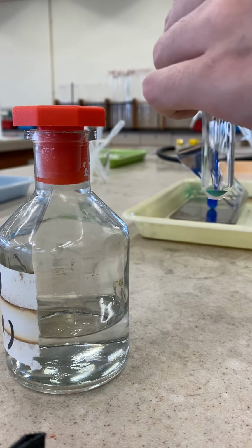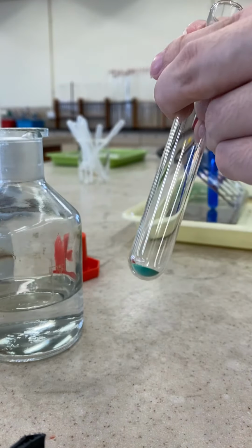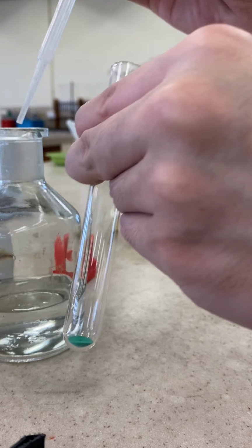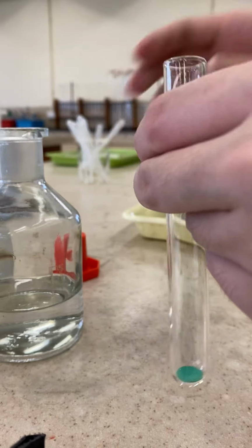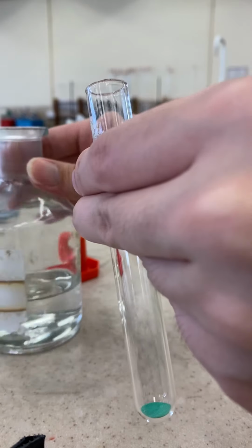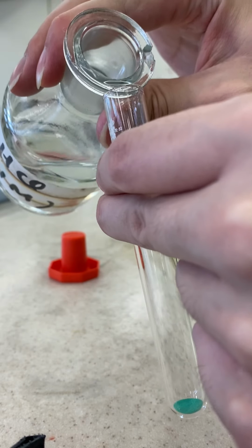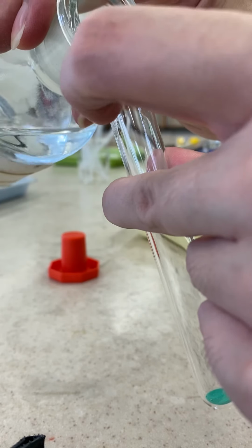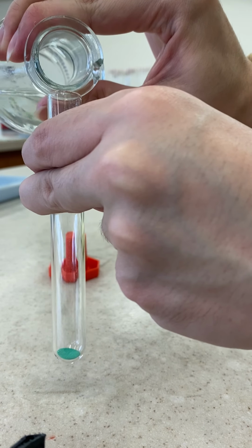But what if I mix them to see if any chemical reaction takes place? So, some acid. The dropper is not working. Maybe I directly pour the acid inside. But be reminded that when you are doing this direct transfer, the test tube and the reagent bottle should touch each other, so that the liquid can follow the walls and then pour into the test tube. So maybe adding around 1 to 2 cm to see what will happen.